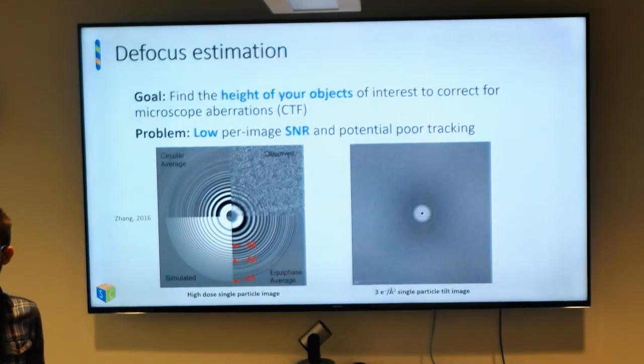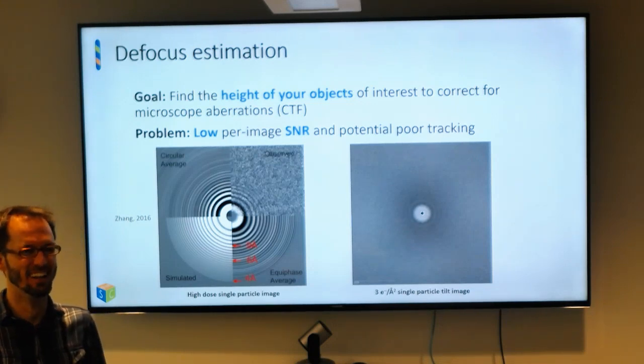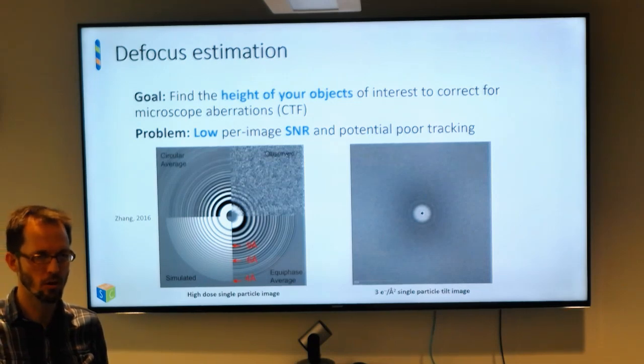Okay, defocus estimation. How much of this have you got? How well does Tomo do compared to fiducial alignment? This is always asked, and I haven't heard it asked yet. Yes, good call. I don't think anybody's done a direct test on a real sample. I think I've heard of somebody doing a synthetic sample.